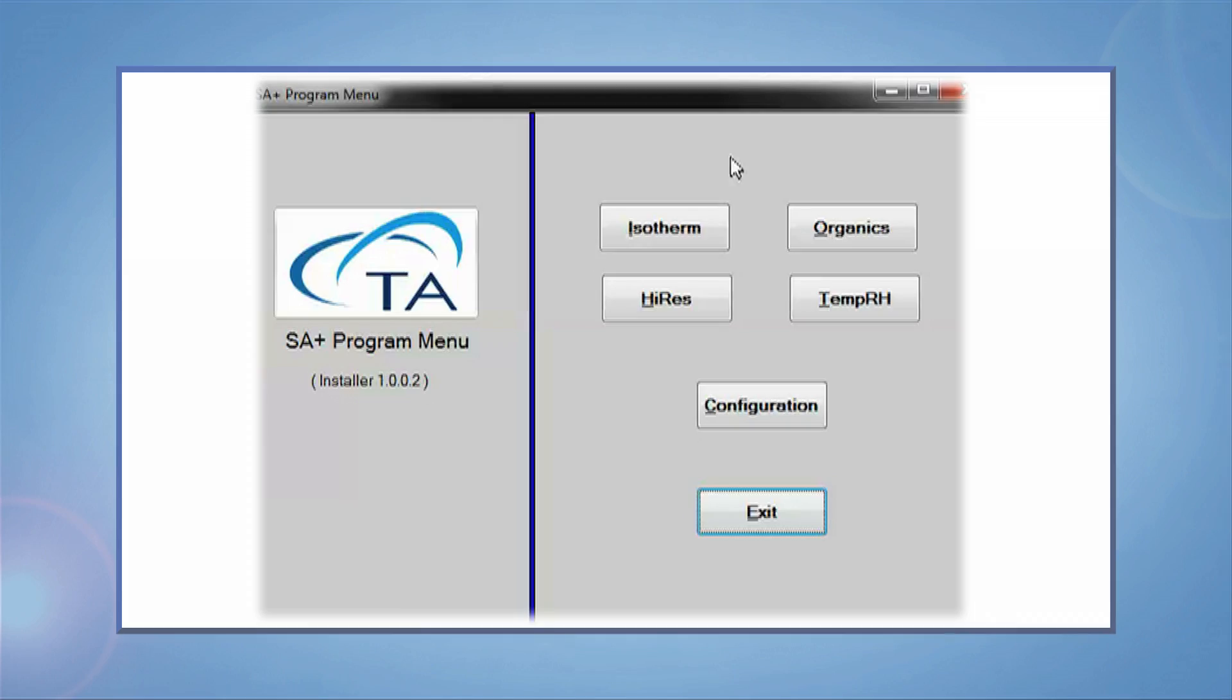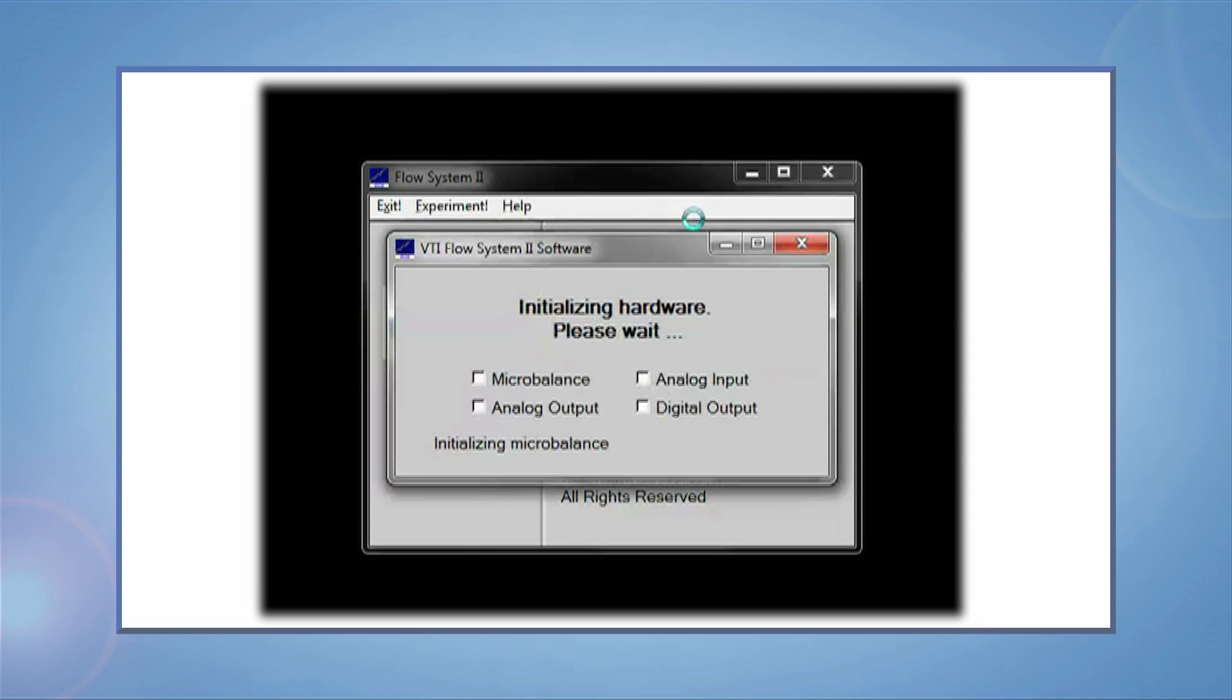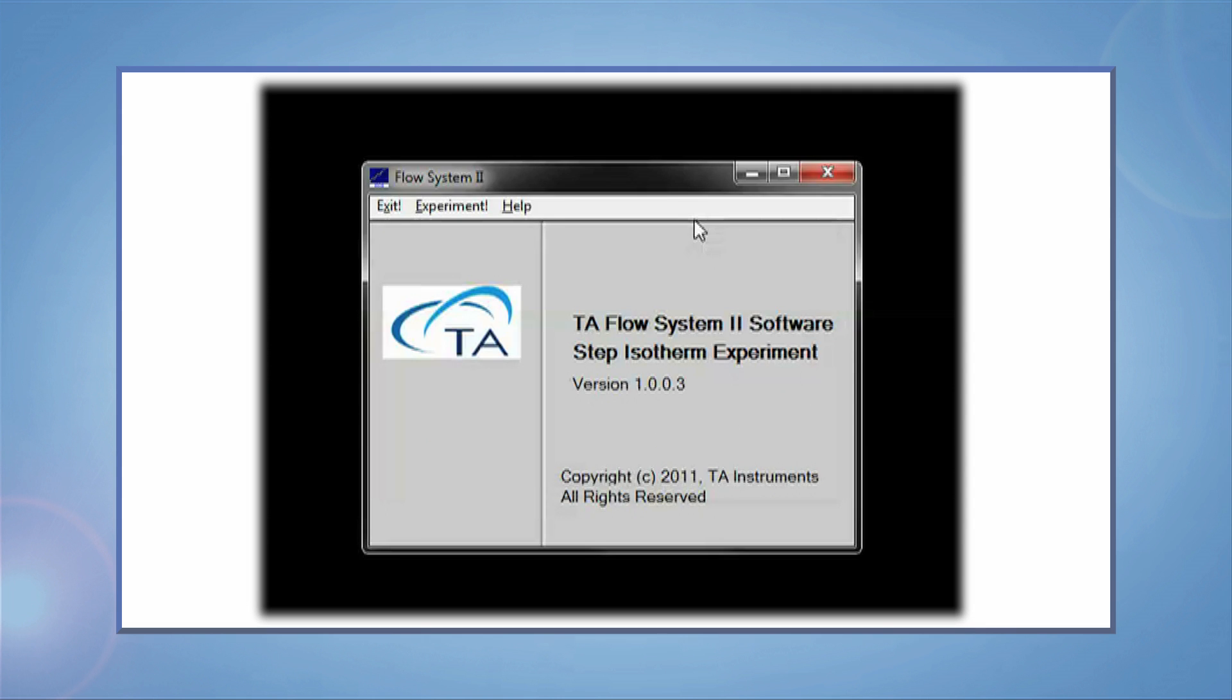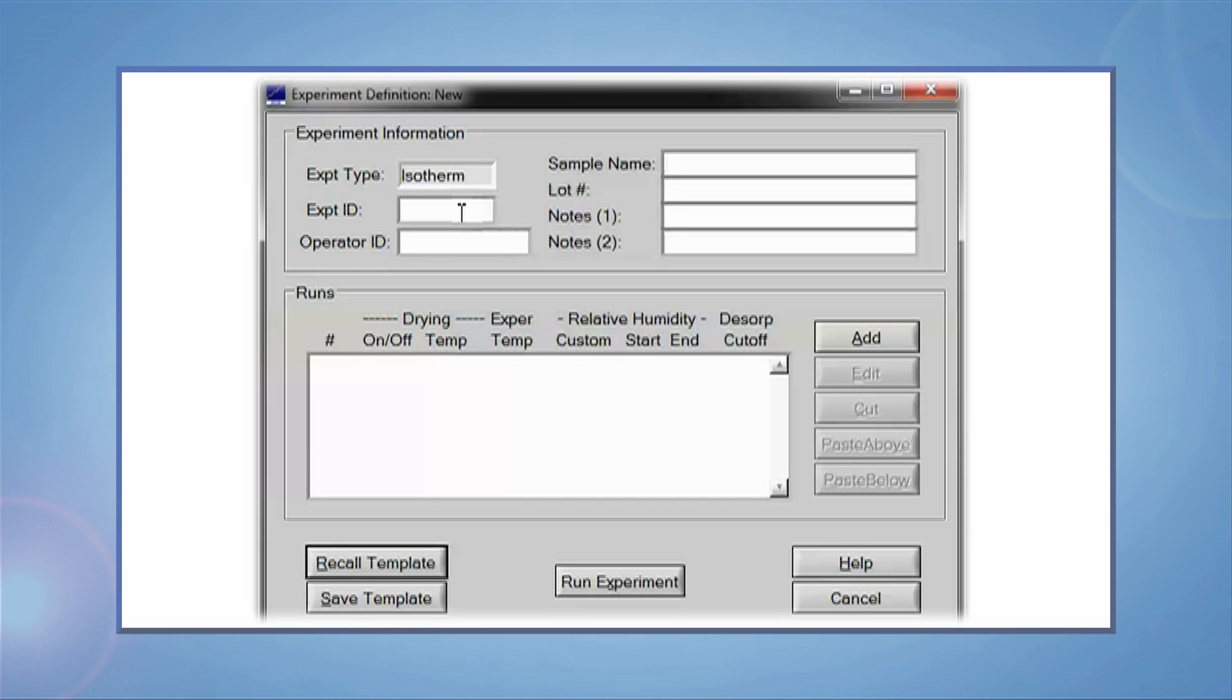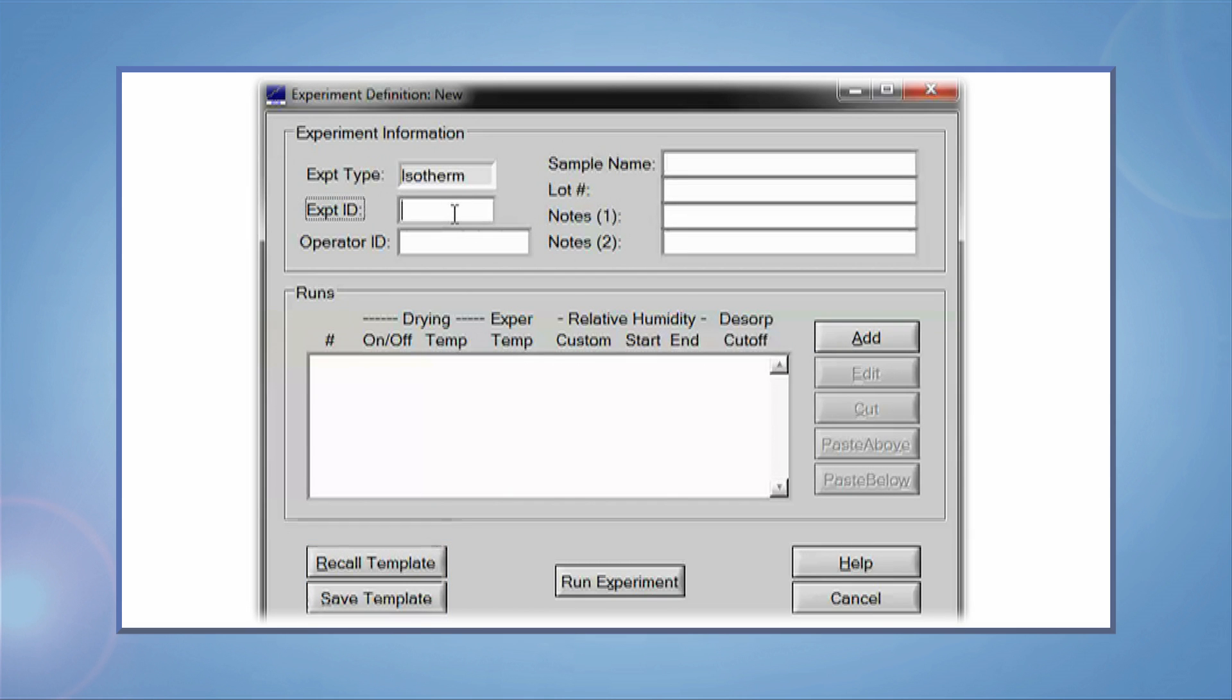To start the water sorption experiment, open VTI Essay software. Please note, experiment definitions can be saved as templates and then recalled later. We begin with an empty experiment.